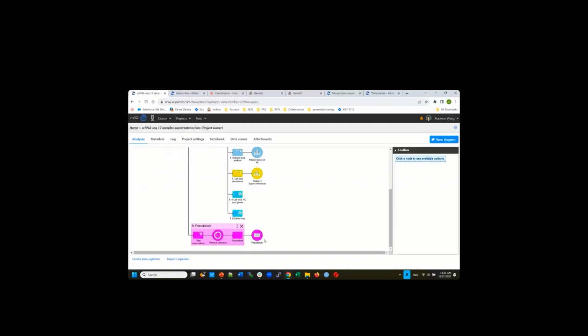After you've done that, you can see the circle compared to this. When you see there's a cell inside, it means that this is single cell data. When you mouse over, it will tell you how many cells: 12 samples of 57,000 cells. But this one is 48 pseudo bulk samples, and the same number of genes for every gene.